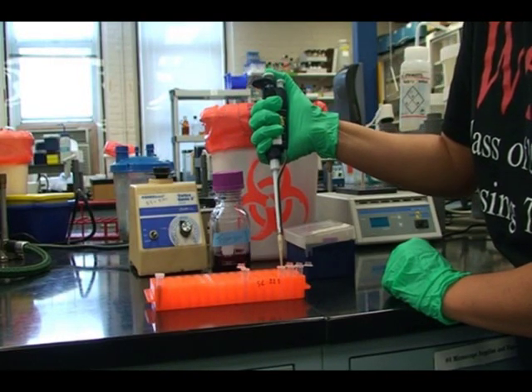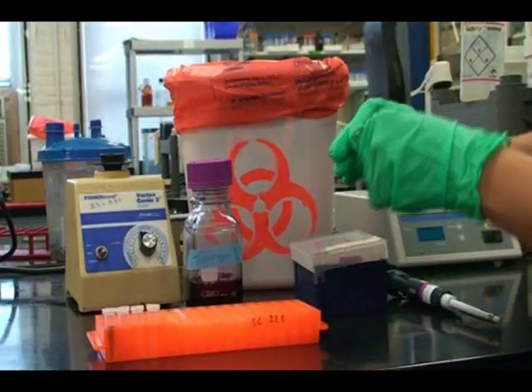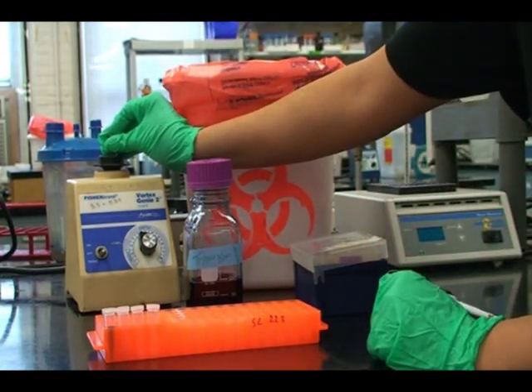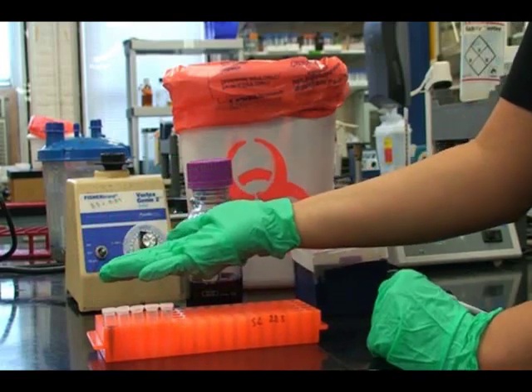Repeat this process of pipetting 100 microliters from the previous dilution to the new dilution until the end concentration is met. Remember to throw out the pipette tip after each dilution, close the 1.5 milliliter tube and vortex before starting the next dilution.